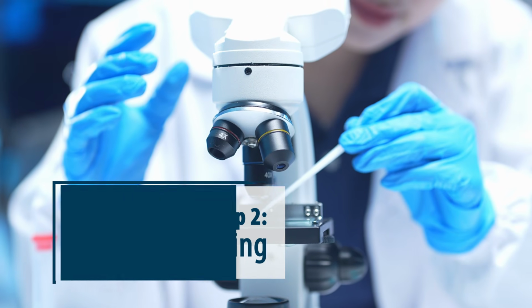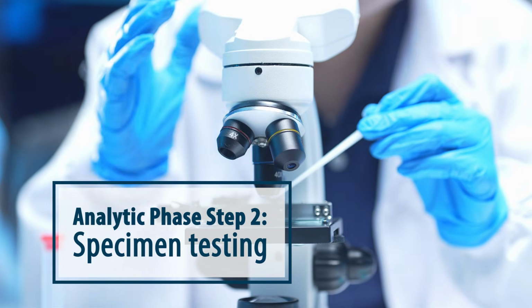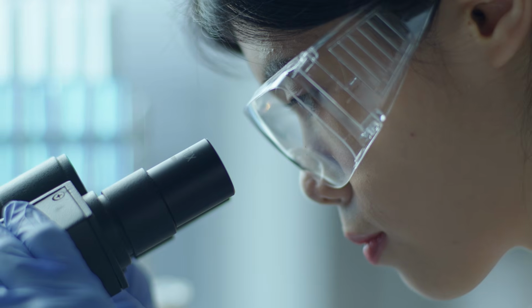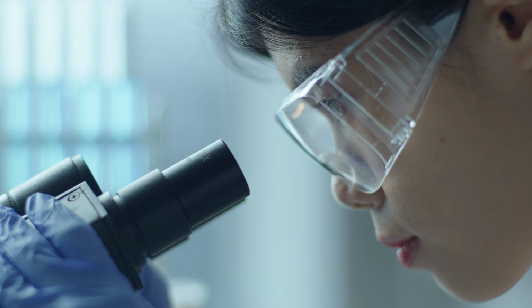The last step in the analytic phase is specimen testing. Follow the procedure manual when performing each designated PPM procedure. The test results will assist you in making diagnostic decisions.